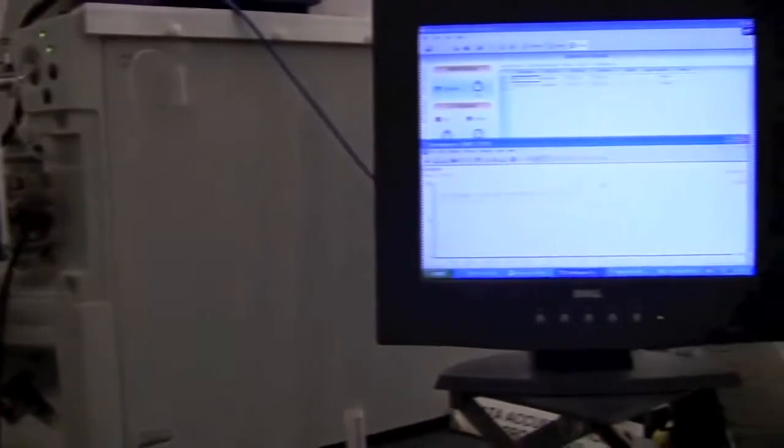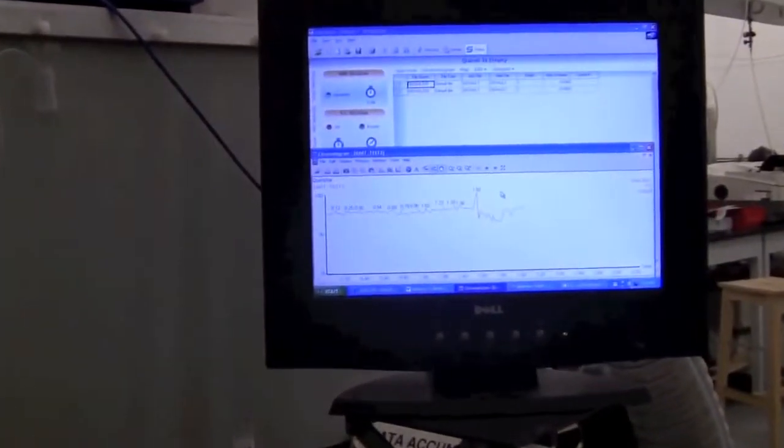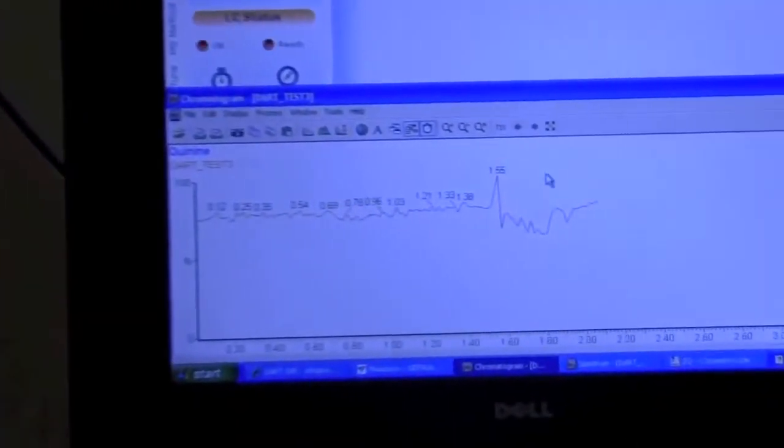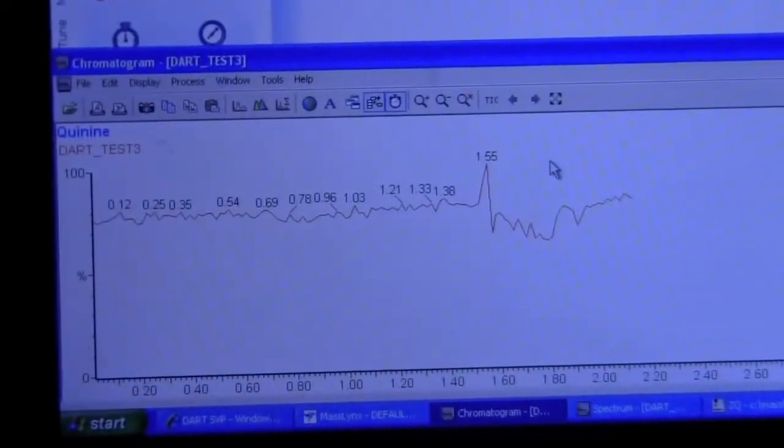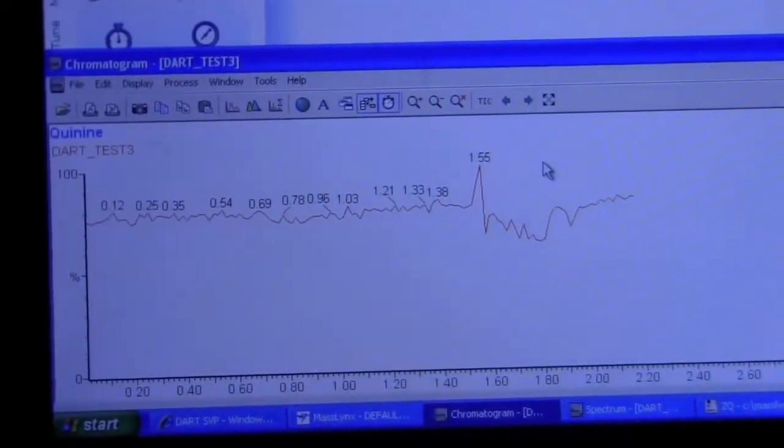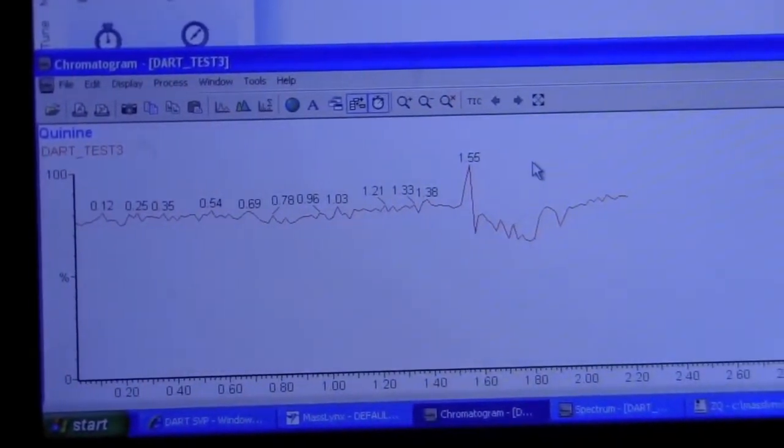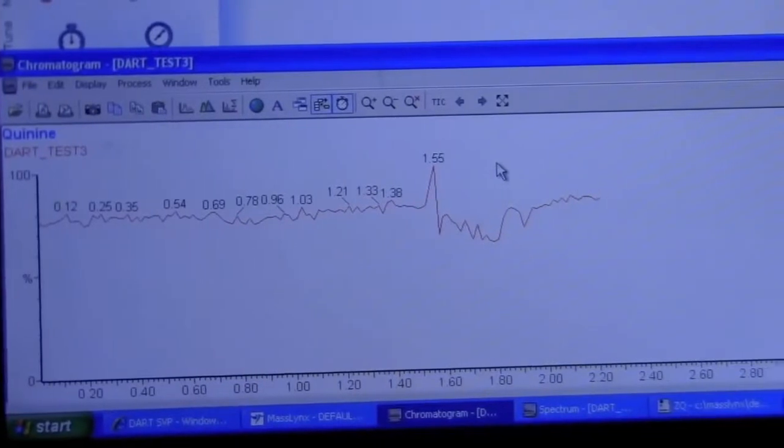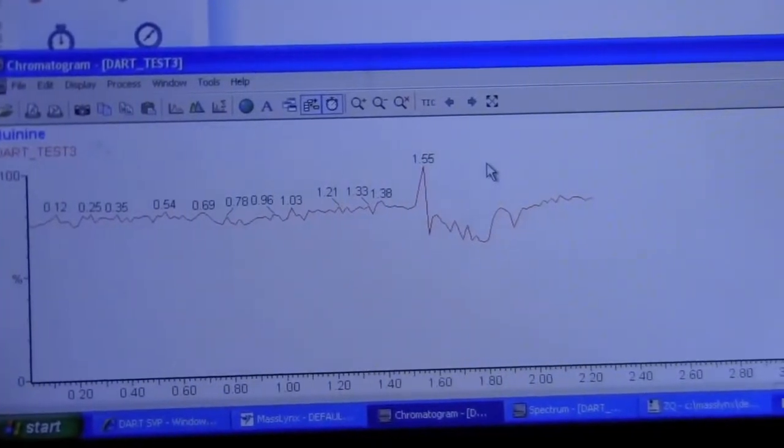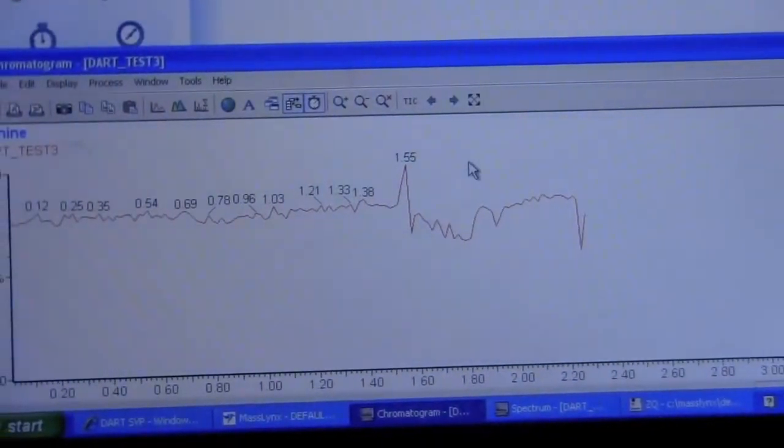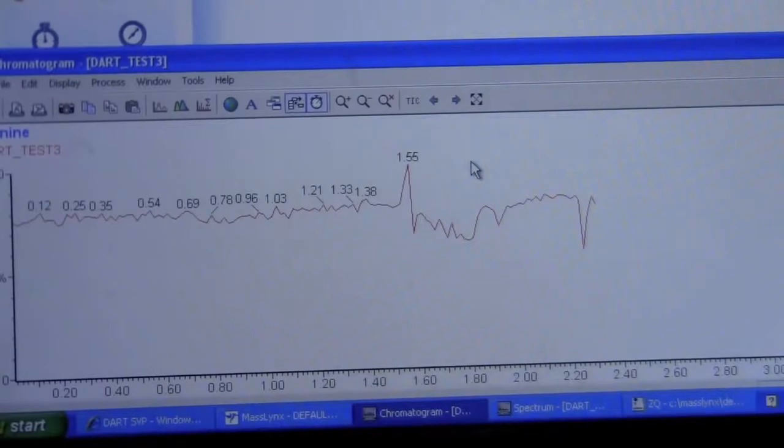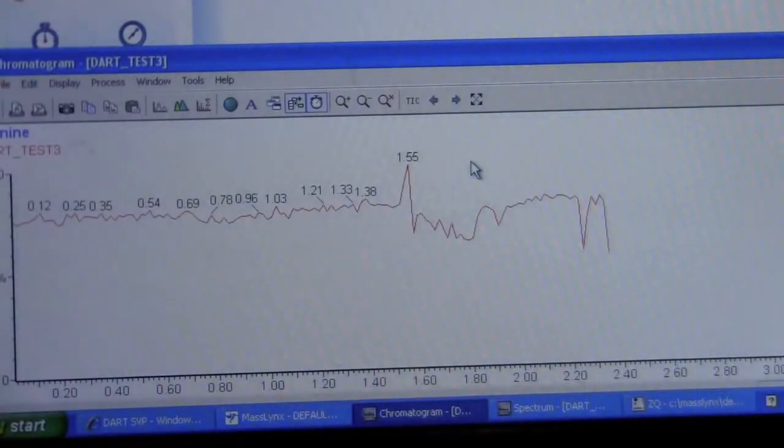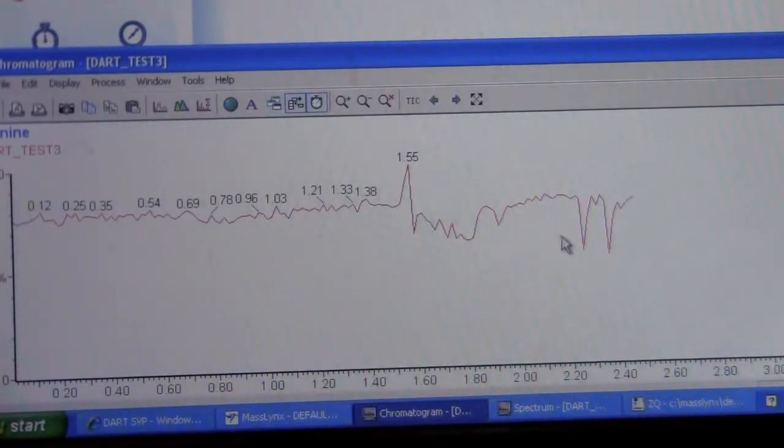Now, if we go back to the chromatogram over here, we may see as we put the sample into the source that the ion count goes down. This is normal. This is because our capillary is blocking some of the stream of the ions. And those are typically the areas we want to observe our mass.